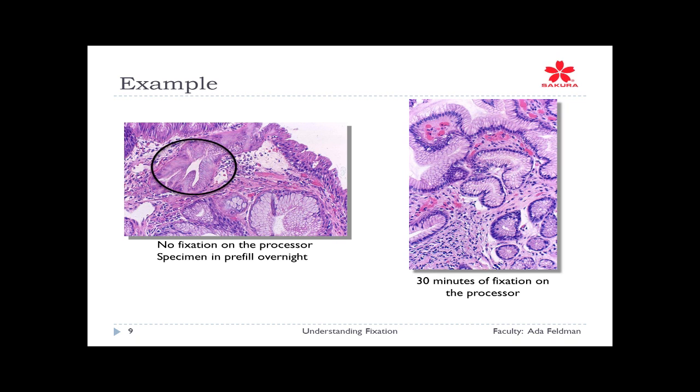It sat in the specimen container for easily 8 to 10 hours. All right? Her processing schedule was decent. She actually was using a fixative much better than neutral-buffered formalin. She was using a buffered zinc formalin, which you'll learn shortly how that improves fixation.